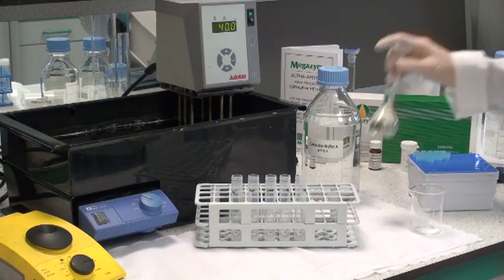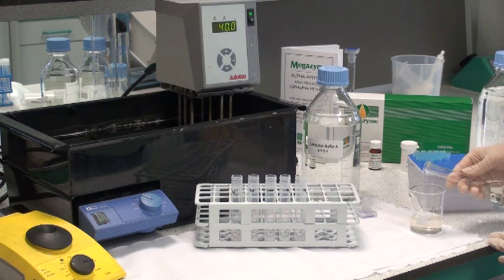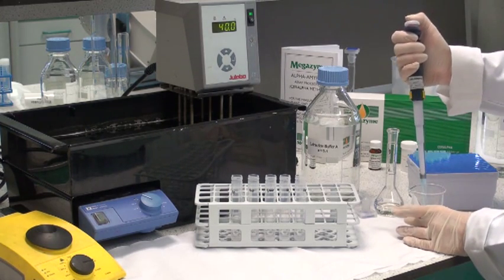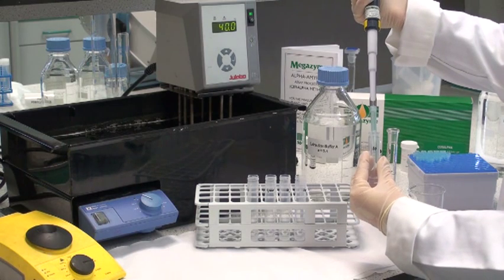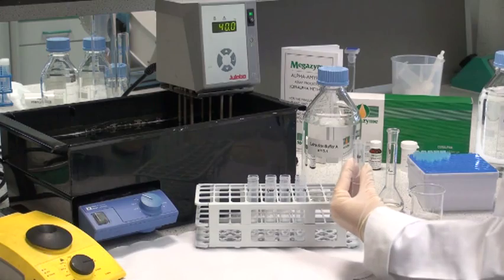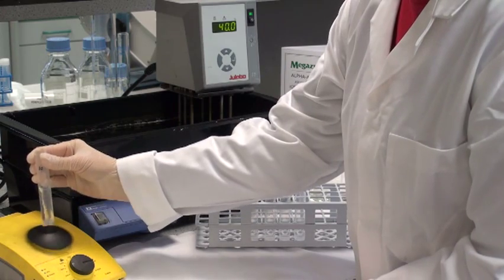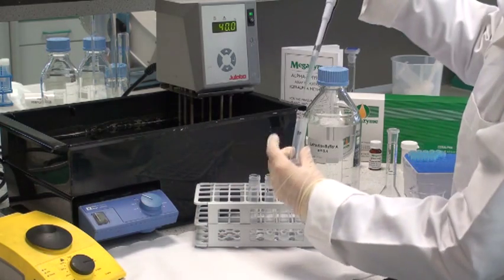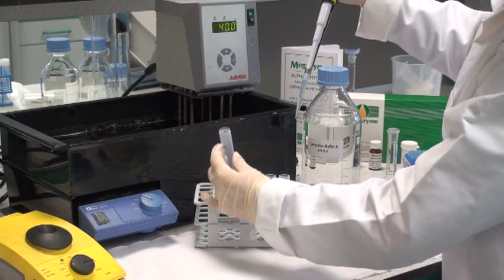First of all, the enzyme is transferred from the volumetric flask into a beaker. Then 0.5ml of this solution is transferred to 4.5ml of extraction dilution buffer, giving a 1 to 10 fold dilution. This is mixed thoroughly on a vortex mixer. This 10-fold dilution of the enzyme preparation is then diluted further by taking 0.5ml of this solution and transferring to 4.5ml of the buffer, giving a 1 in 100 dilution.